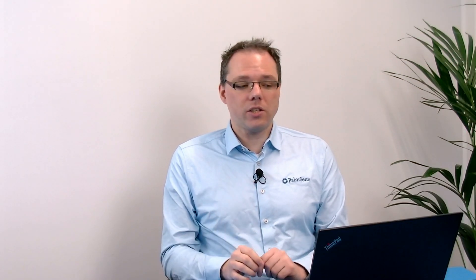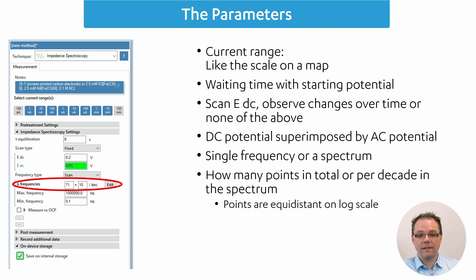Because usually impedance spectroscopy results are plotted on logarithmic scales, the frequencies that are chosen for you are equidistant on a logarithmic scale. If you want to know which values are used and maybe even change them, you can use the edit button to make it an individual list of frequencies.